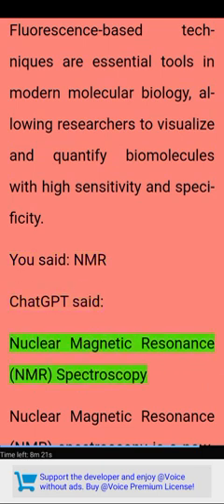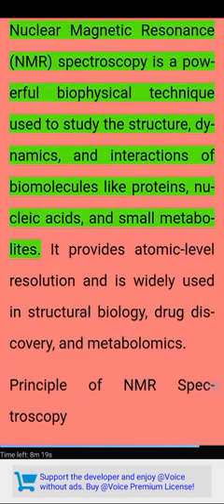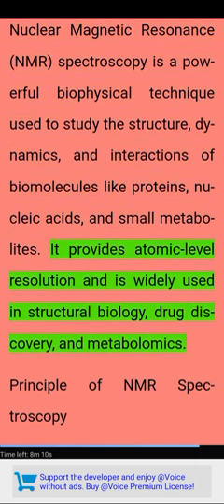Nuclear magnetic resonance (NMR) spectroscopy. Nuclear magnetic resonance (NMR) spectroscopy is a powerful biophysical technique used to study the structure, dynamics, and interactions of biomolecules like proteins, nucleic acids, and small metabolites. It provides atomic-level resolution and is widely used in structural biology, drug discovery, and metabolomics.